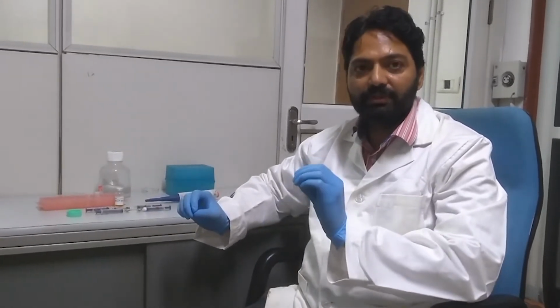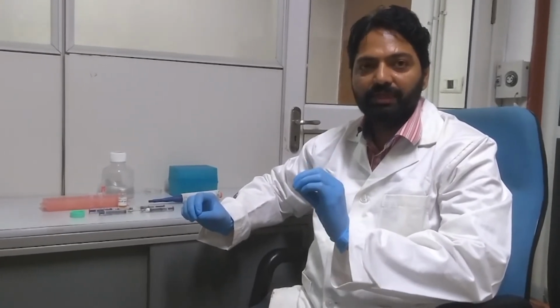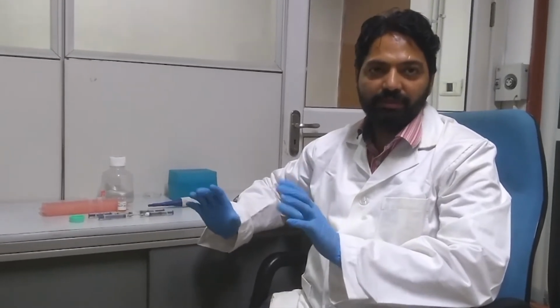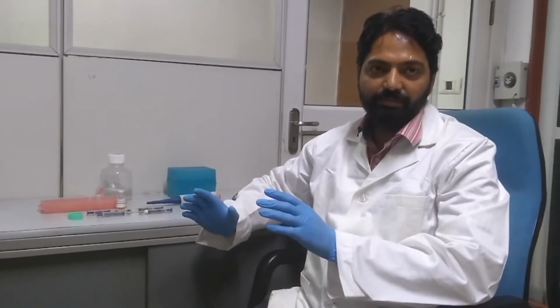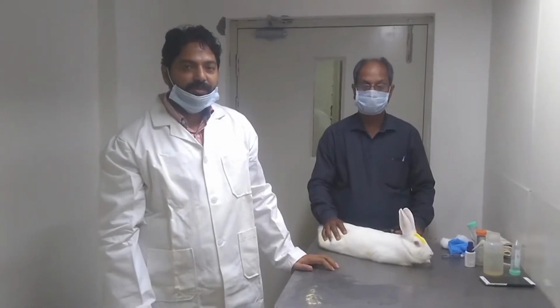Otherwise, if you inject antigen as such in PBS or in other watery system, it will be spread out in the body and it will be cleared out by the immune system readily, and no memory cells will be generated. So this is the main purpose of preparing the emulsion. Now we have prepared the emulsion.